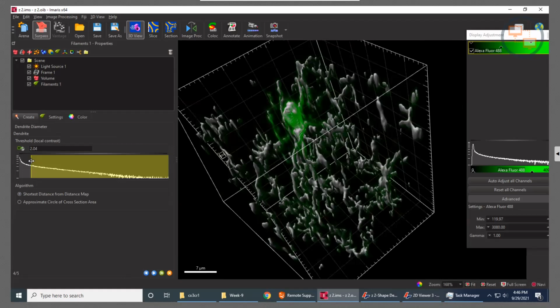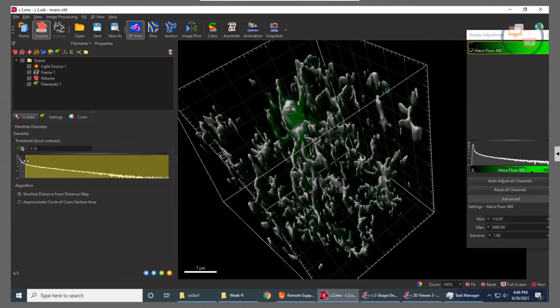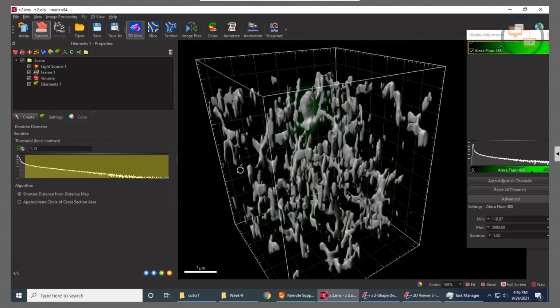And that is why we ended up cropping the much larger data set, because that data set would have taken 15, 20 minutes maybe to run one of these on. And until we have a better idea of what the data looks like, it might be better to stick to a subsection where we can play around before we're ready to commit that kind of time investment.